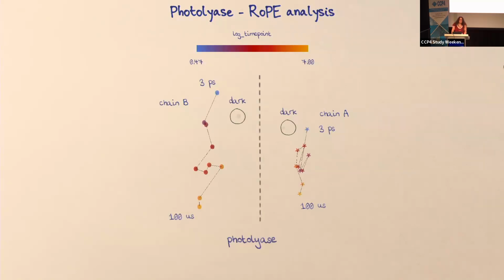It's actually a little bit bigger in the chain B, even though chain A was used in the paper to show the active site region. The functional axis is on the near vertical, but there's actually some substantial off-axis jitter, and that's probably what's making it difficult to actually see this effect when we overlay the structures because there's a bit of noise. So that makes it very difficult to interpret by eye when you're looking at overlays of protein structures. The natural variation of the protein conformation makes it quite hard to distinguish these features.